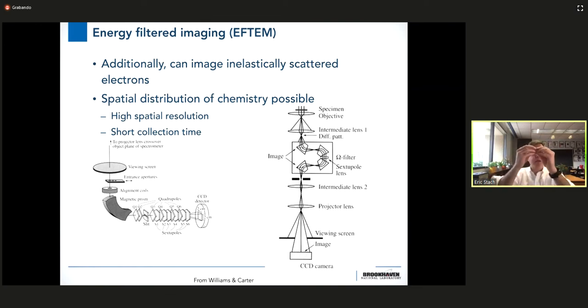We can look at the electron energy loss events to determine spectroscopically what atoms cause those events, to learn about their near edge features for oxidation and reduction. So diffraction, imaging, chemistry with ranges of magnification so that we can do atomic scale, nanometer scale, submicron scale, all through the same sample. So the microscope's very powerful, okay?